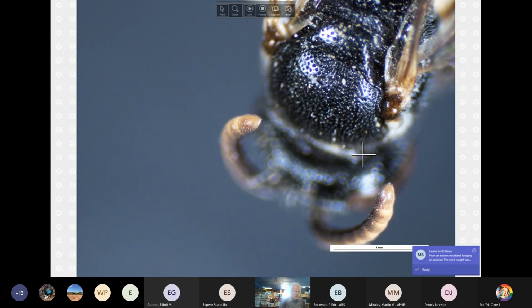There's others I don't have examples of. Sparsus, for example, the front coxae have a literal spine coming out of it. The outer edge is just prolonged out to a spine. Why? I don't know. There's a couple other species with pretty distinct facial patterns, Fedorica. So I think I'm about out of specimens of interest right now to show and illustrate some of these points.